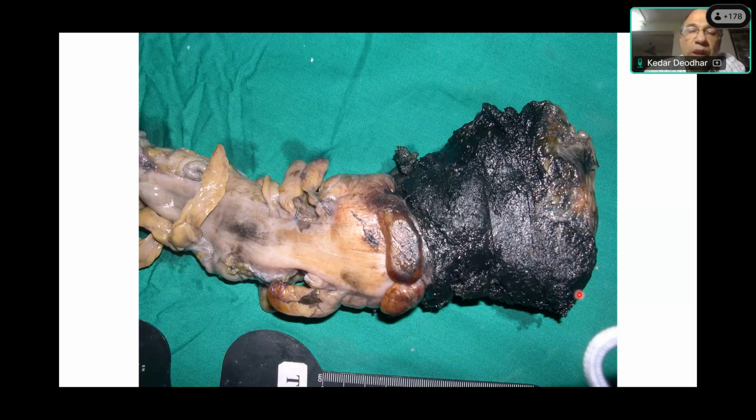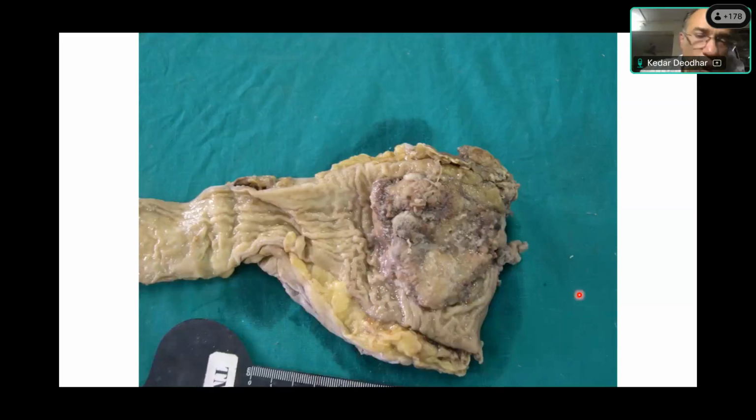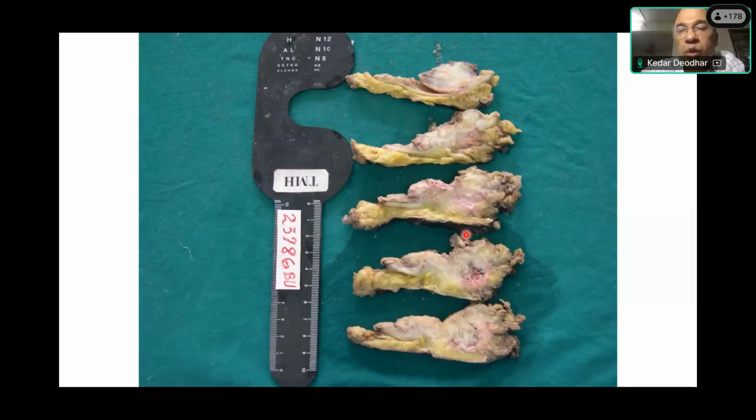So this is from the open anterior aspect. There's a tumor in the rectum here, and I will cut it in transverse sections. To be honest, this is not completely fixed because we should not see any pink areas, but suffice to say that this is what I will lay out in multiple slices. You lay it on the table and look for the area which is deepest to your CRM, and select a block from this area, this area, this area, this area.